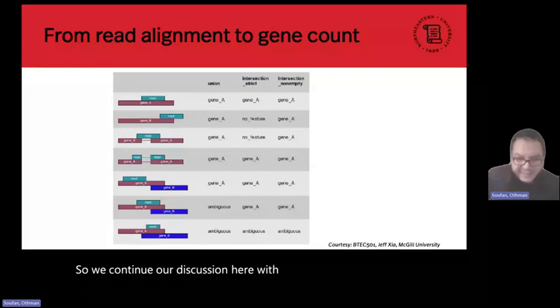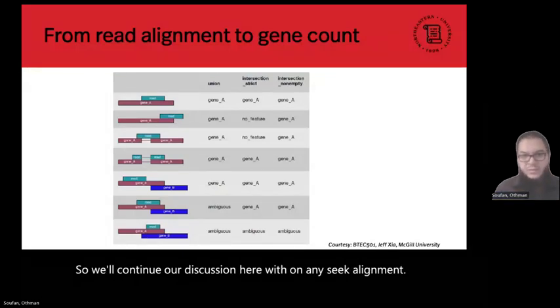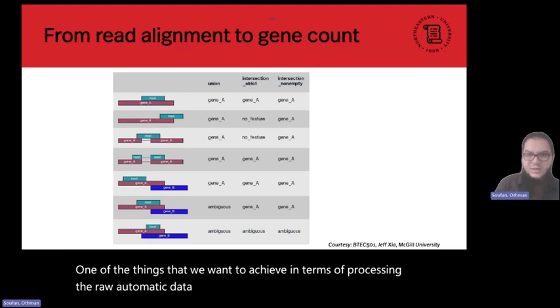Our discussion here is about RNA-seq alignment. One of the things we want to achieve in processing the raw RNA-seq data is looking at the gene counts.